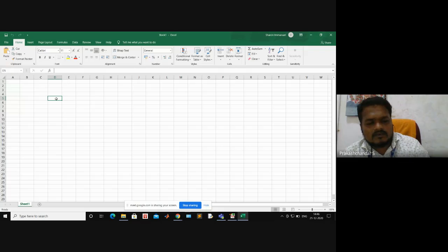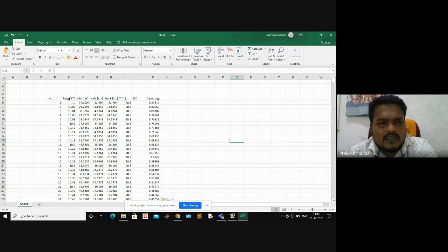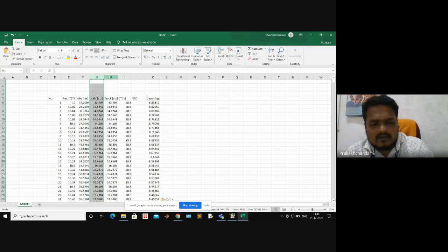Paste it here. But we need only the 2 theta and this one, so the remaining you can delete.